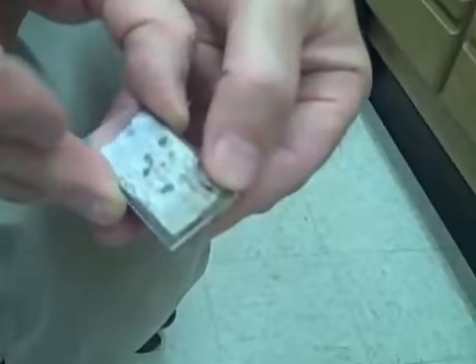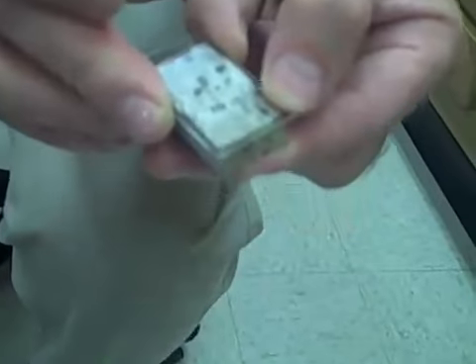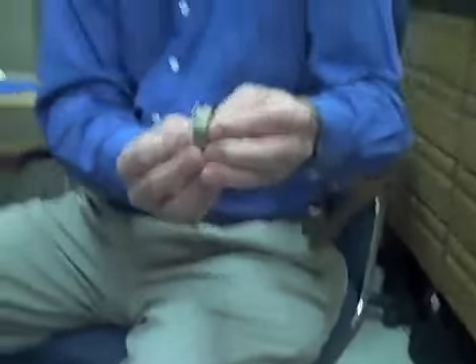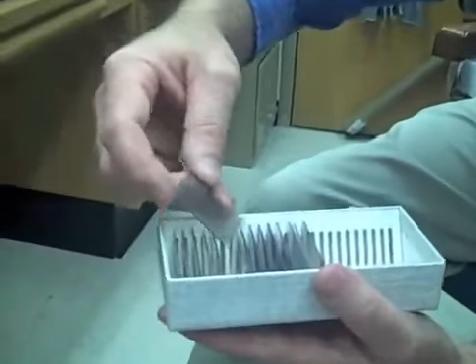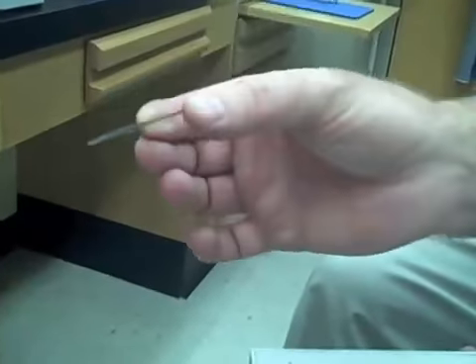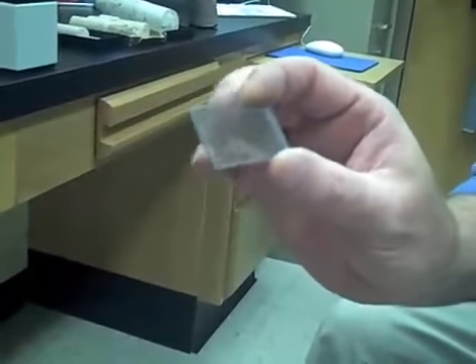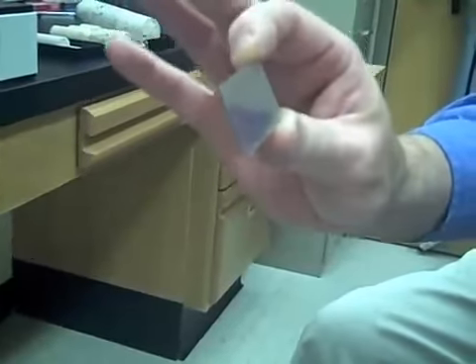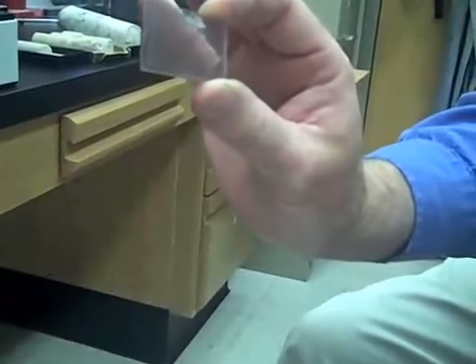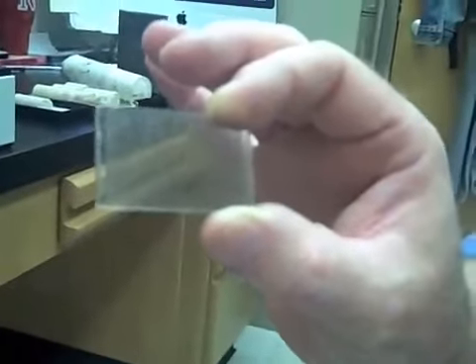And so those grains that you can see there, perhaps, those are sand grains. That would be glued with epoxy, and then again using a diamond saw we would trim this off. And I have some finished ones here. These are now ground down to about 30 microns thick, which is a very, very thin slice of rock. And at that thickness, many of the minerals become transparent to light.